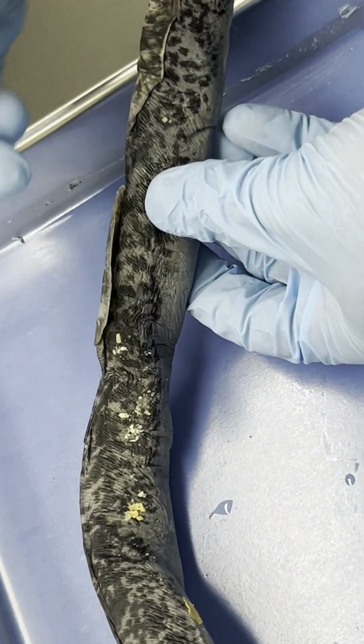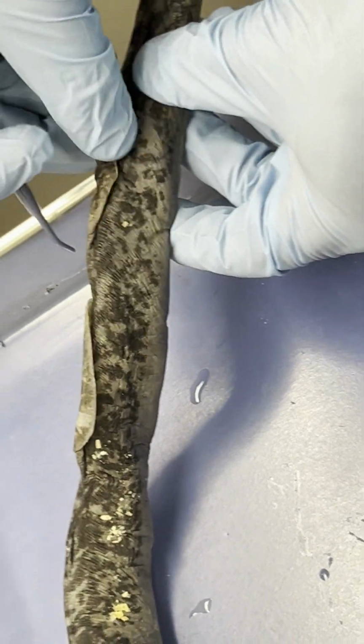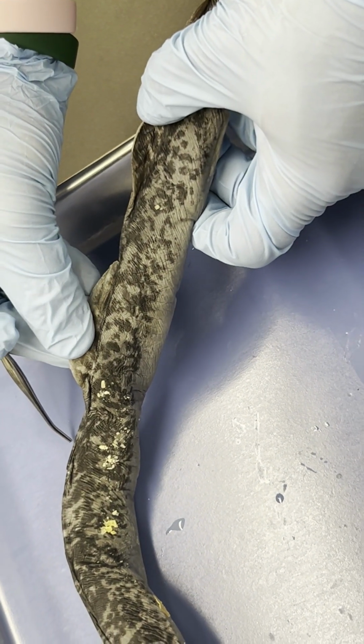This is going to be anterior, closer to the head, the anterior dorsal fin, and here we actually have a posterior dorsal fin. These are considered single fins, not paired. So what do I mean by that?